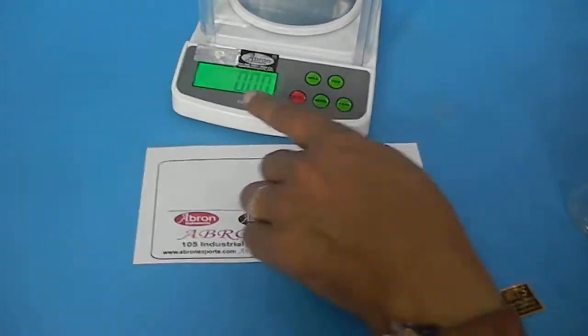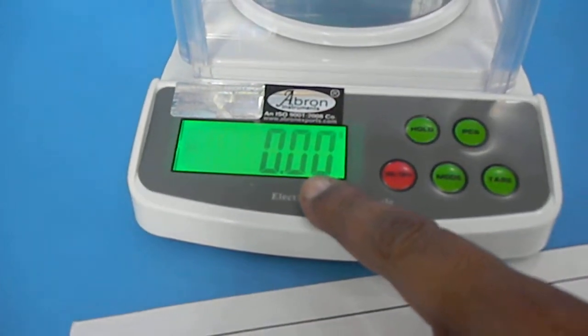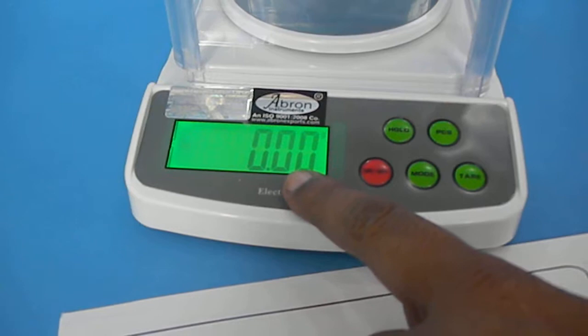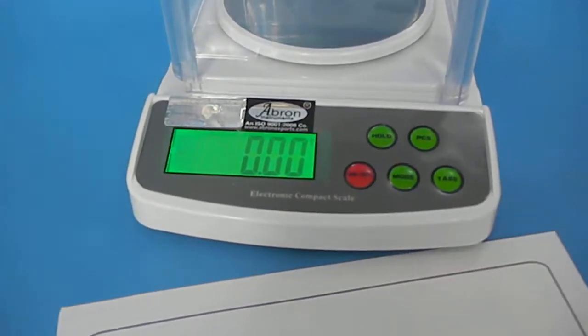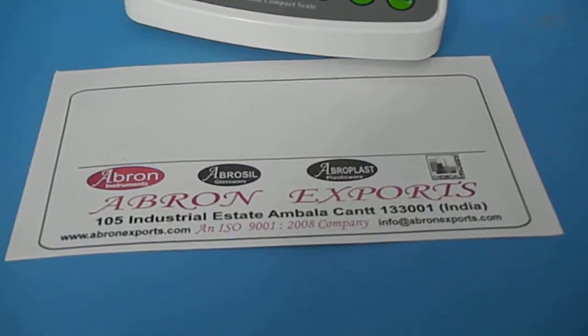This has 500 gram capacity and 10 milligram accuracy - a two-digit balance. Please visit our website. Thank you very much.